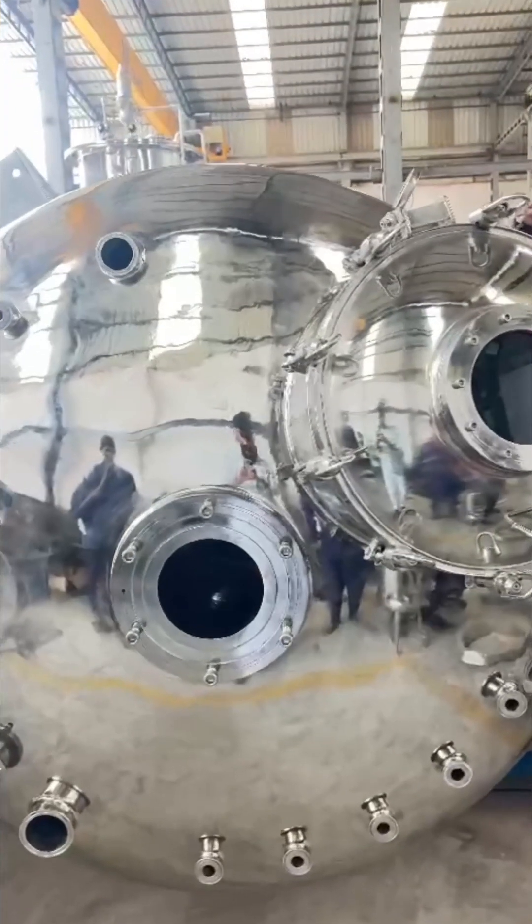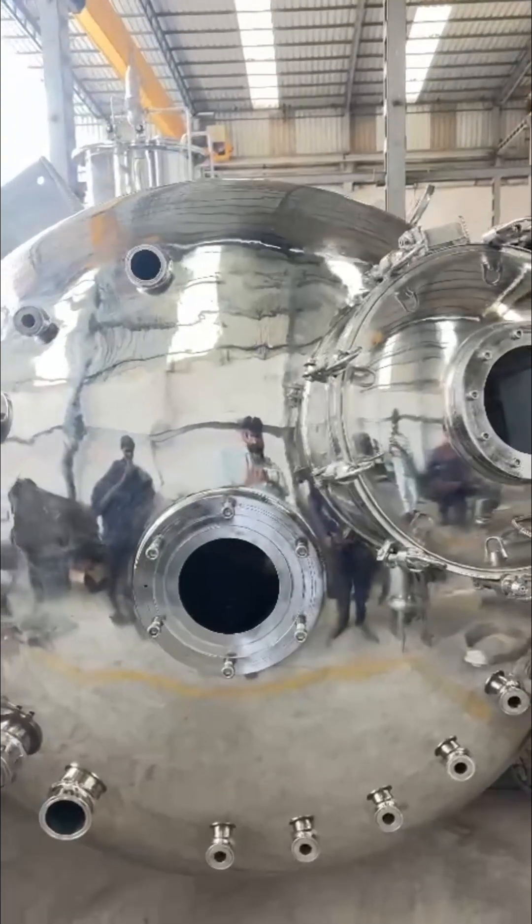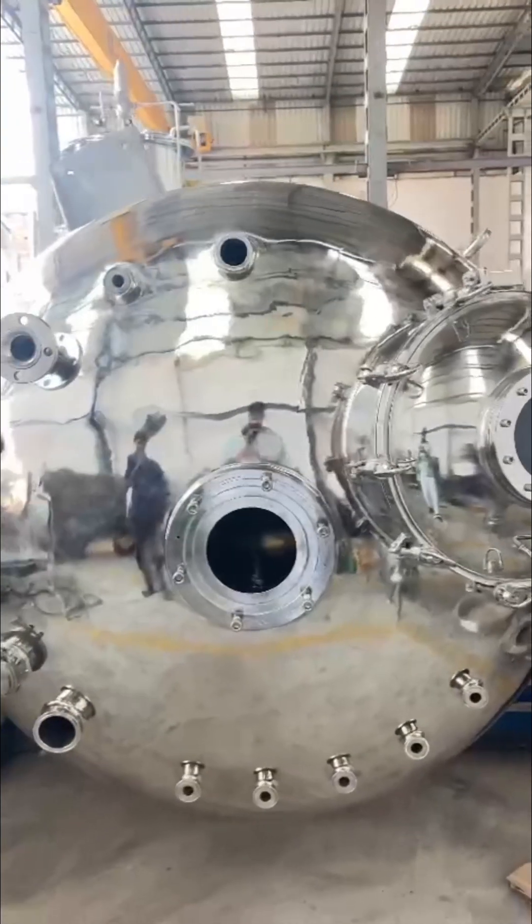On the top head, you'll notice a manway with internal legs, allowing operators to safely access the insides of the bioreactor.